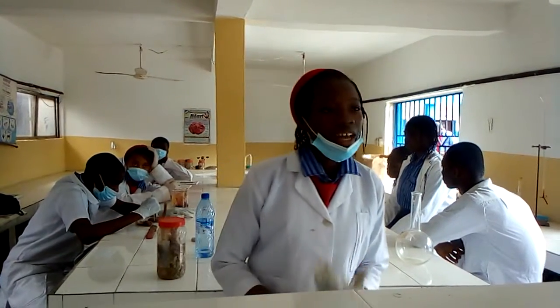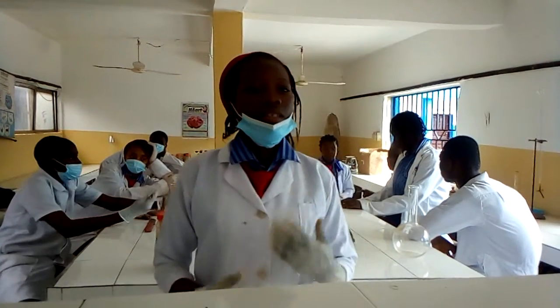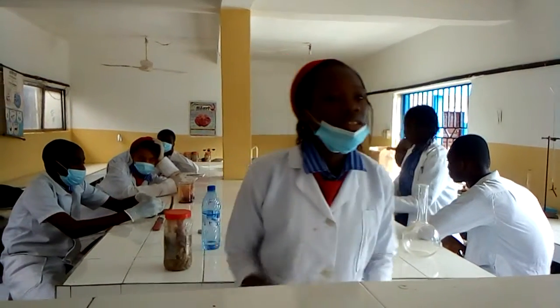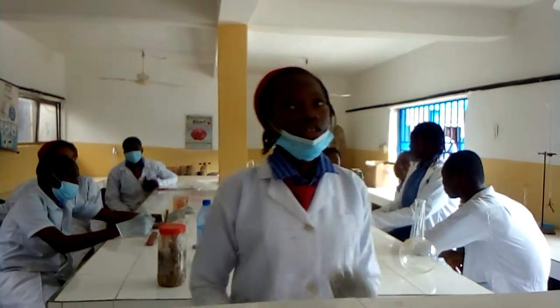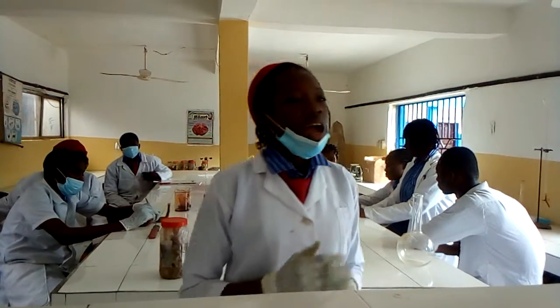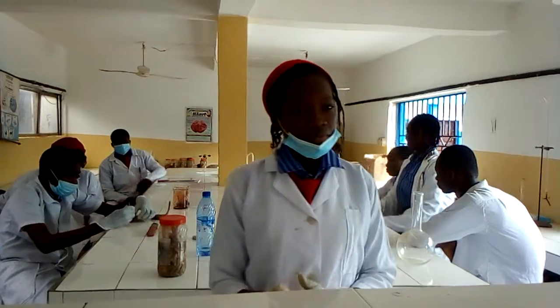The procedures for dissection are: we place the animal on its back on the dissecting board using your dissecting pin. Forelimbs and the hind legs are held on the board with the dissecting pin. You might be wondering why we use the animal we are going to use for this dissection. We choose to use the chicken because it is the one that is commonly found around our environment, so it is easily seen closely.